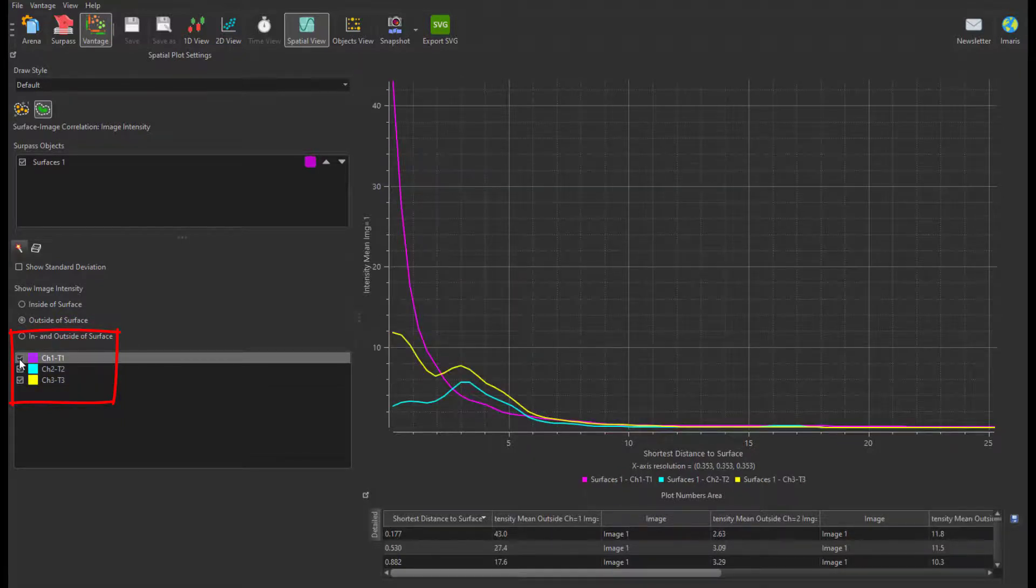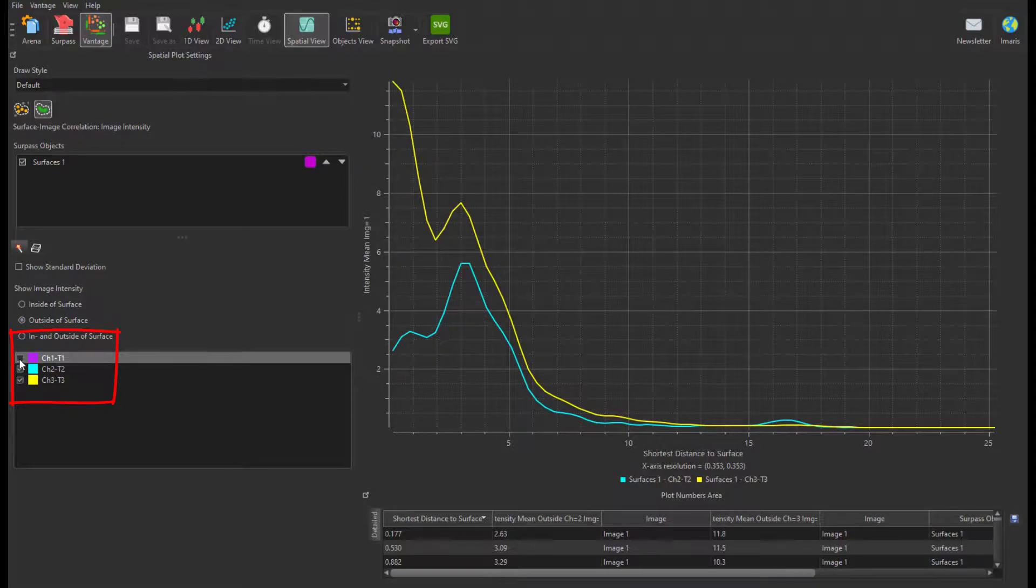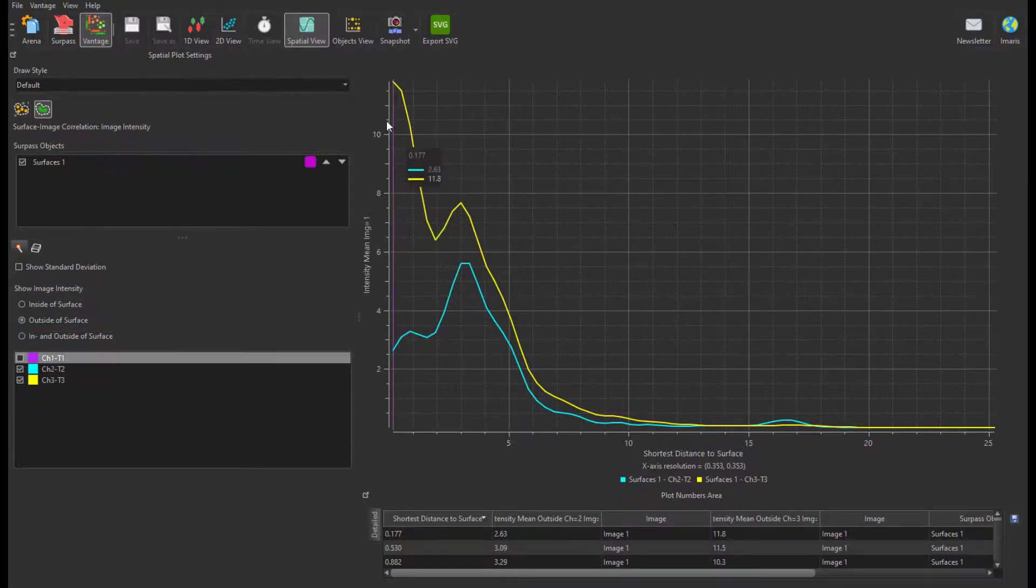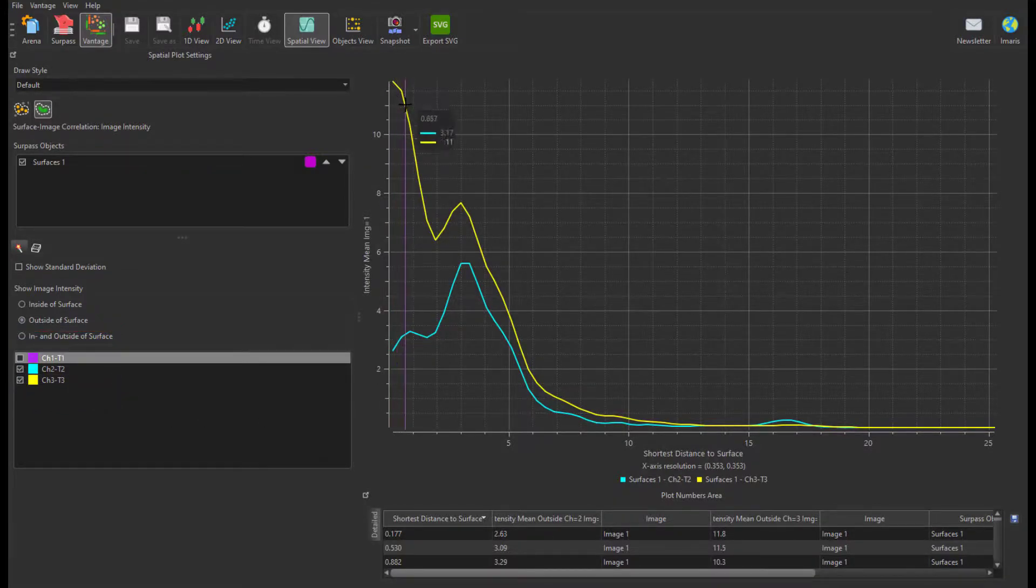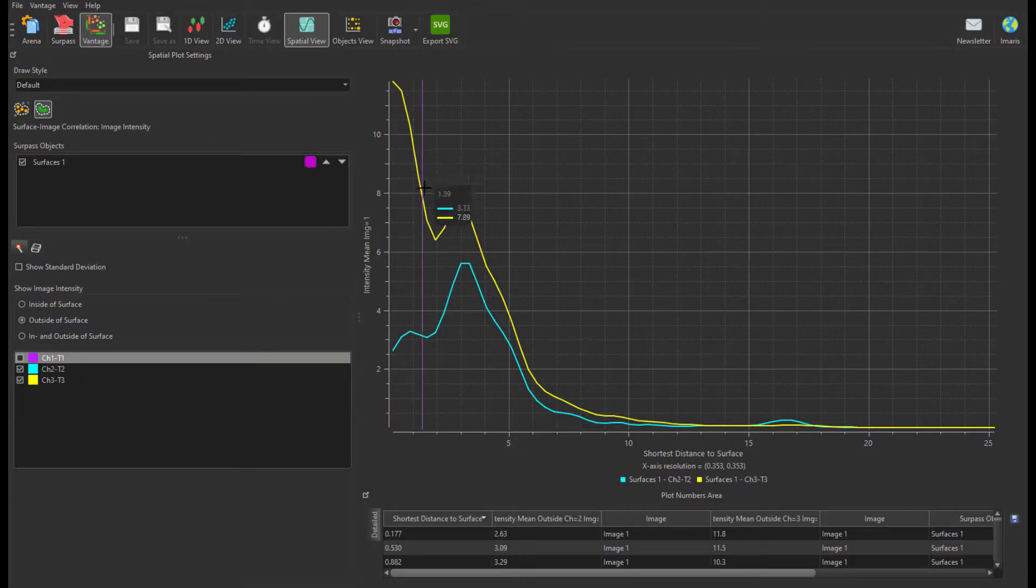Within this plot, I see a peak of accumulation of the yellow signal around the surface edge and a small peak of cyan and yellow a few micrometers away.